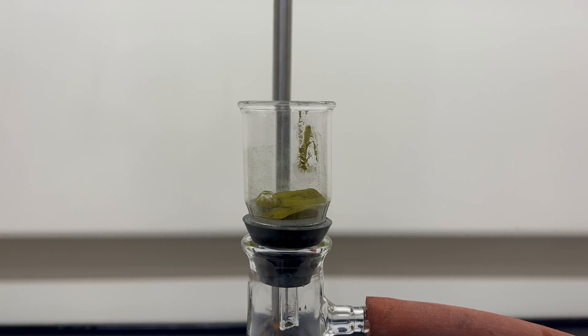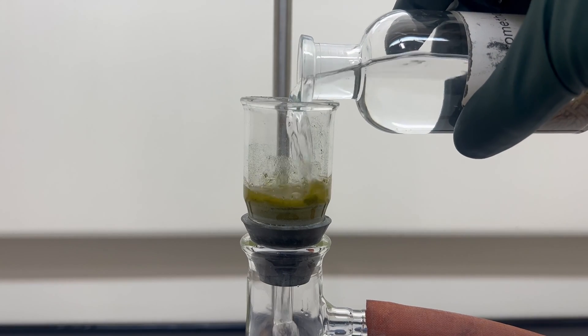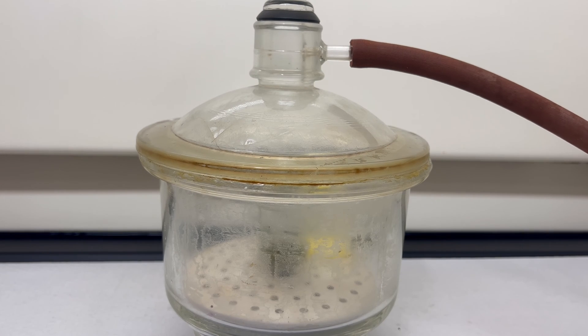The uranium tetrachloride is being washed with dry dichloromethane till the washes run clear. Next the frit is placed into a vacuum desiccator and dried for an hour under vacuum. This will drive off any leftover organic volatile chemicals.